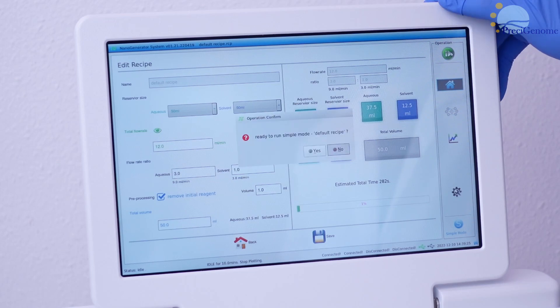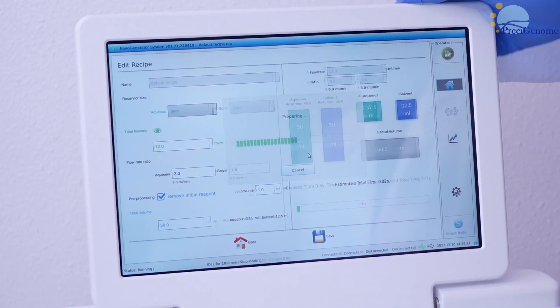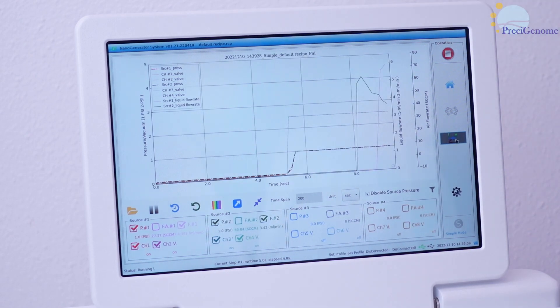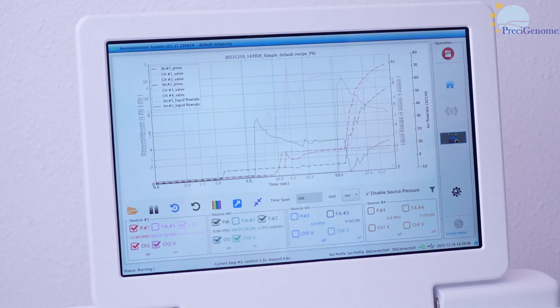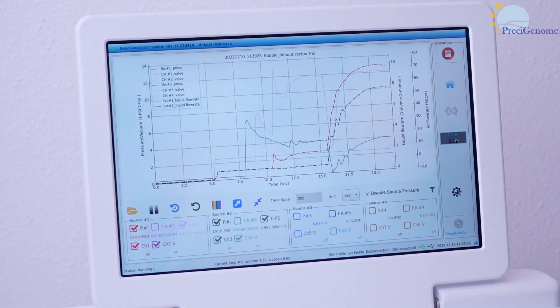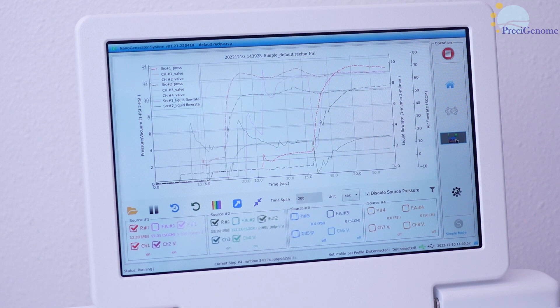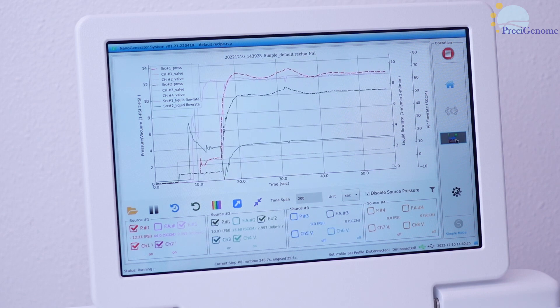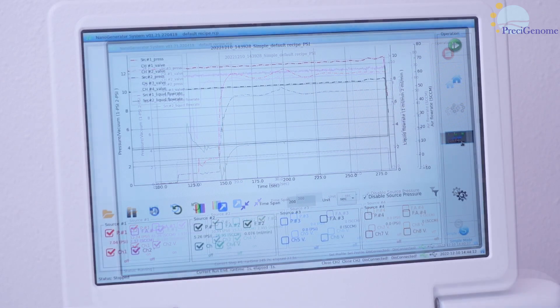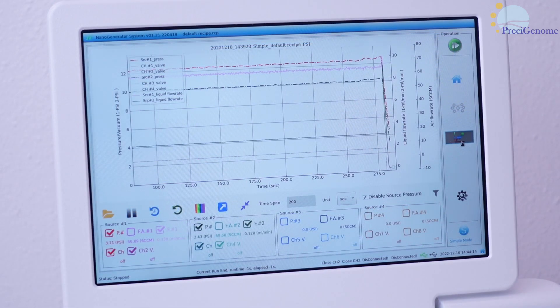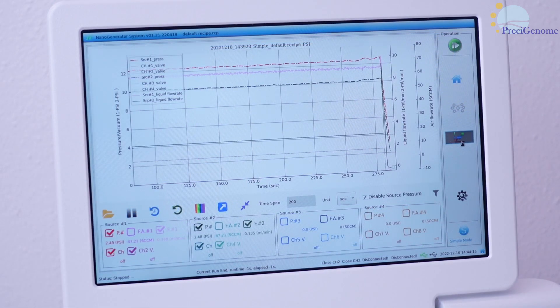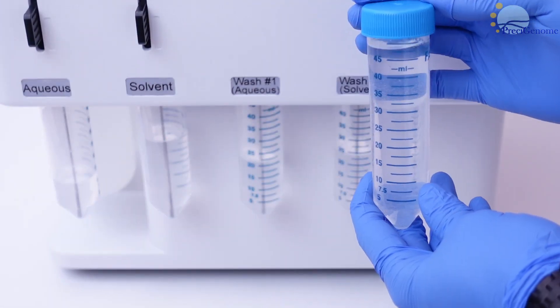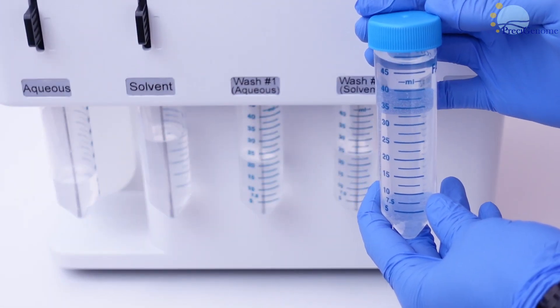During operation, you can monitor the live pressure and flow rate of an active recipe. The live feed lets you toggle which parameters to track, load previous assay results, export detailed analyses to a flash drive, and more. A typical recipe will be completed within a few minutes. From here, you may disconnect the collection reservoir to access your product.